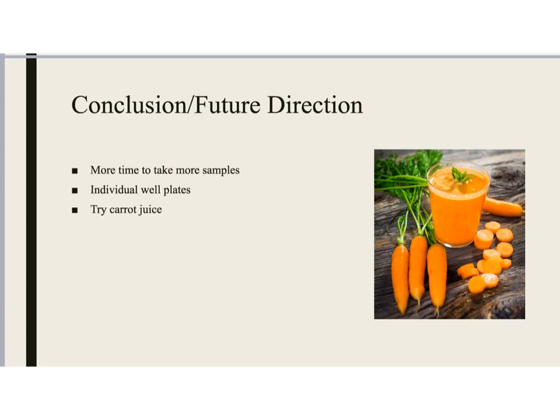This way I can test it at 12 hours, I can test it at 24, 48, 72, and just keep looking at this, hopefully the same cell plate and cell vision to see what is going on with these cells when we do give them carrot extract.